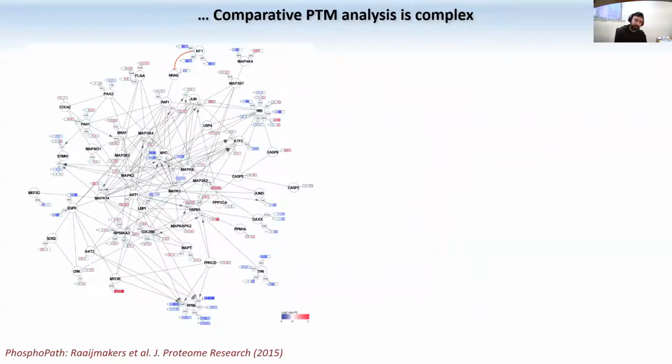And here is just to give you a feeling about how you can represent these modifications. Right? This is a network similar to the one that I showed you before. Also, this one is done with Cytoscape. And then the question is now, how regulated are my modifications? Like in this study, they are specifically phosphorylation. It could be something else.